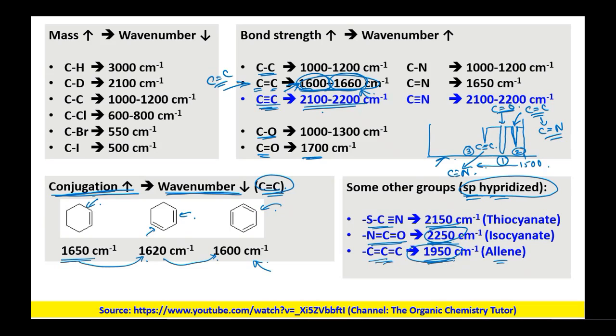So whenever I am telling about this 2100, 2200, you have to keep in mind. If I can say X plus or minus A, this A may vary from 20 to 40 wave numbers up and down. It happens because depending upon your chemical environment, in what solvent you have developed these things, it varies. This much it varies. So you have to use your judgment while you are trying to analyze the FTIR peak. These are some of the generalized wave numbers which have been given to you.